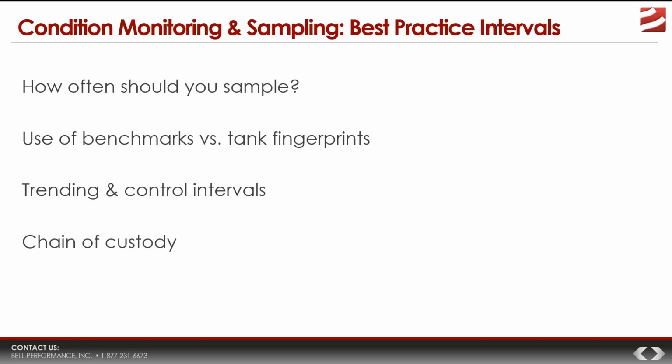So you start with a baseline. The baseline is going to tell us what the microbial environment in our tank is like to start with. Now, ideally, the best time to establish a baseline would be after the system has been actually professionally cleaned, when it's as clean as it could be. Or you might even try to get it, if you're able to, when the system is newly constructed and when it just goes into commission. You establish a microbial baseline at that time.